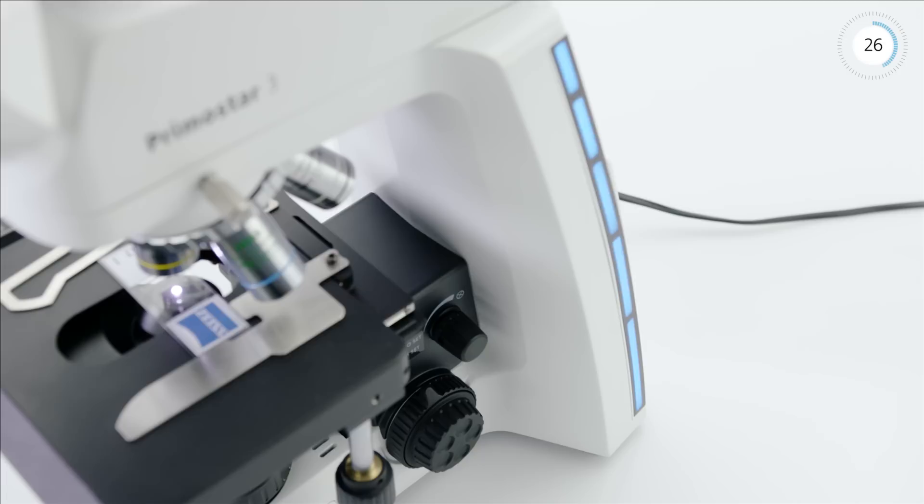Activate Eco Mode and your microscope will go into a power-saving sleep mode if you haven't touched it for 30 minutes.